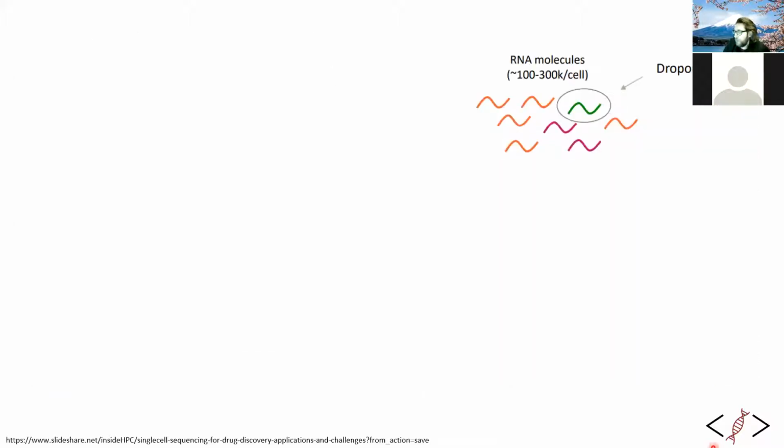This comes from a really fantastic single-cell RNA-seq workshop that is available online. So if you go to this link here, you can see it. They developed this visualization, and rather than recreate the whole thing, because it was so good, I decided to just use it here. So when we talk about the initial RNA population that you could be sampling with single-cell RNA sequencing, we often talk about dropouts. And what does that mean?